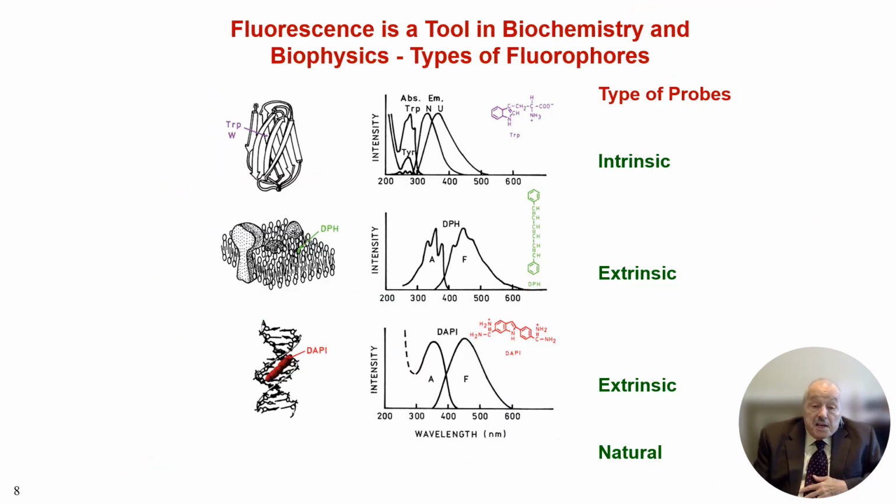And this was changed. What type of molecules are fluorescent that we have? Naturally, we can have intrinsic fluorophores. All proteins, just about all proteins, contain tryptophans, usually multiple tryptophans. They are fluorescent. They're fluorescent in the deep UV where you can't really see them very much.